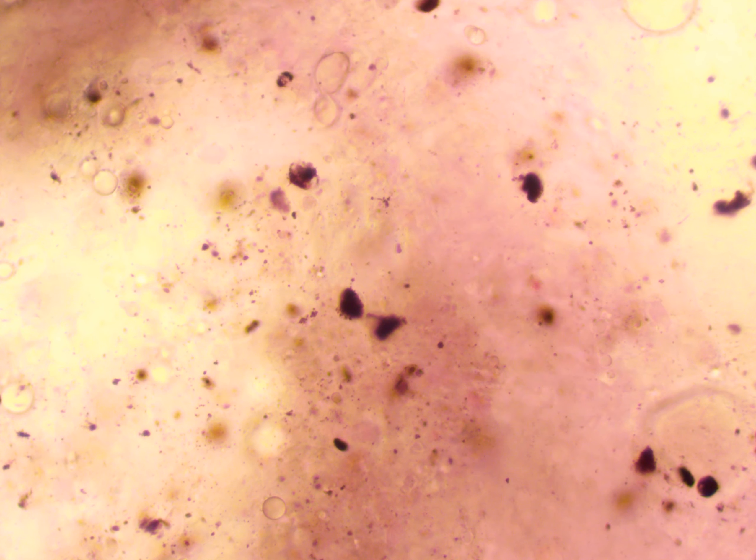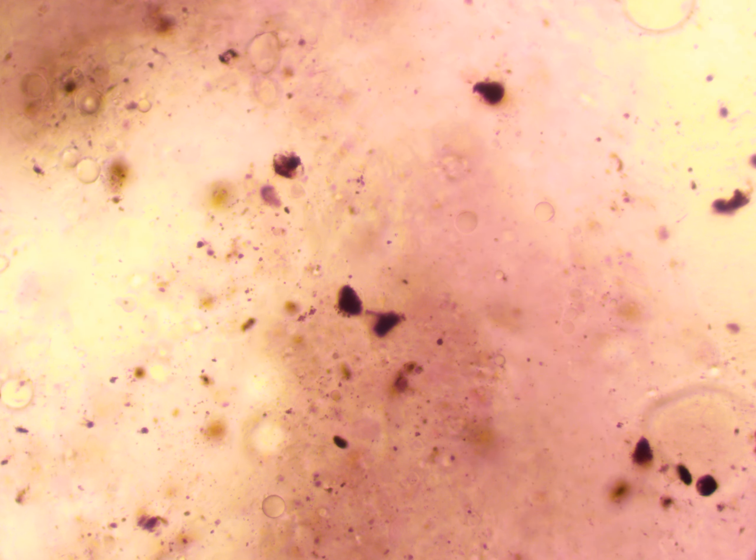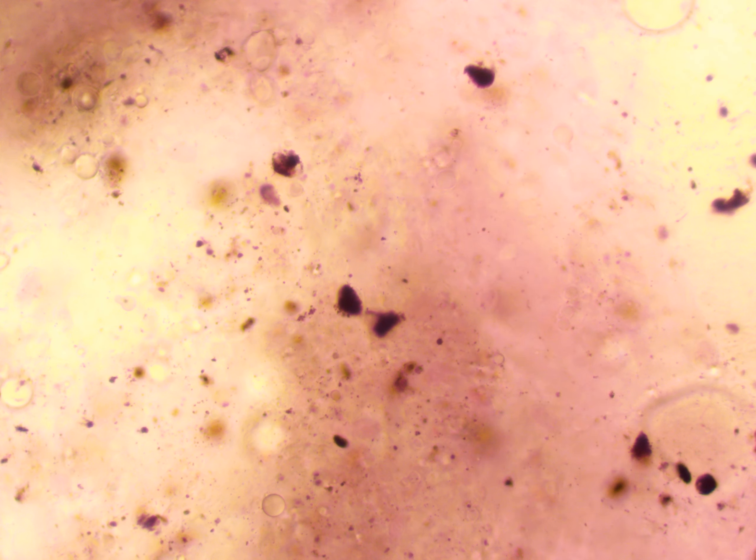But you can see it here, and you can see those cells closer up. They are not very much like the cells of humans, which I'd assume is the only species watching this video.